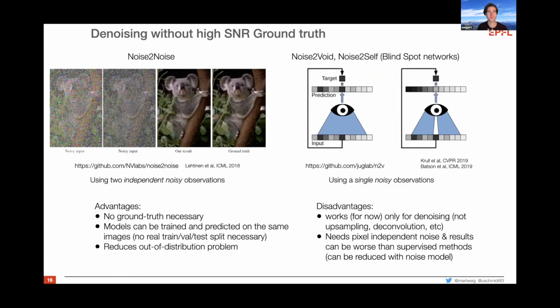So if you do imaging with sCMOS, you see that the pixel gain and noise is actually correlated along stripes in your camera, and that's something that you will probably see popping up in the recovered image, because it's so to speak part of the image that you want to recover, since it's not pixel independent noise anymore. Suddenly you have correlations that go farther than 2 pixels.